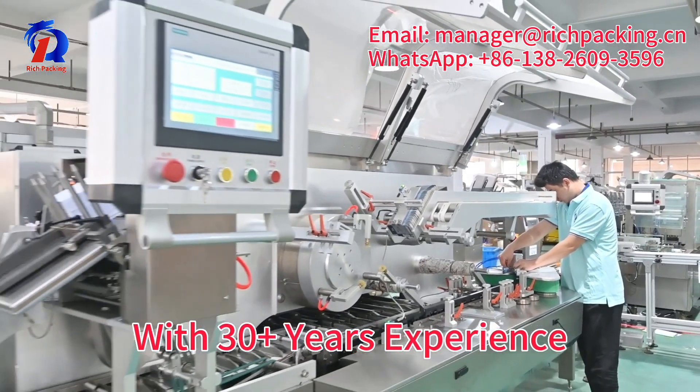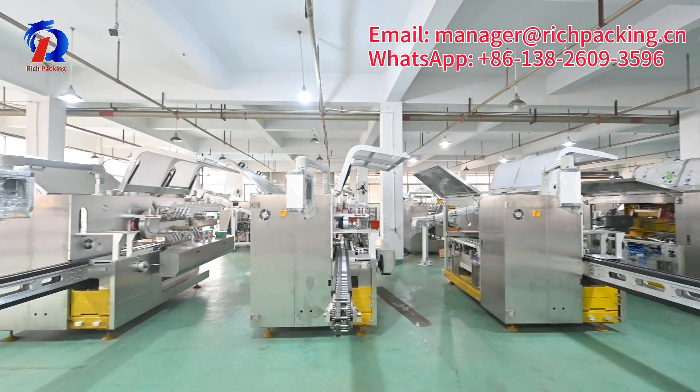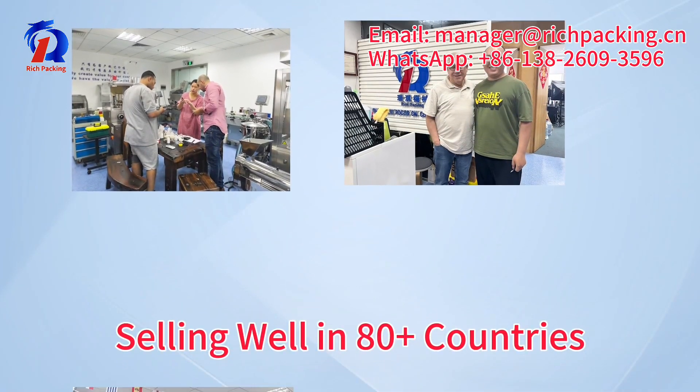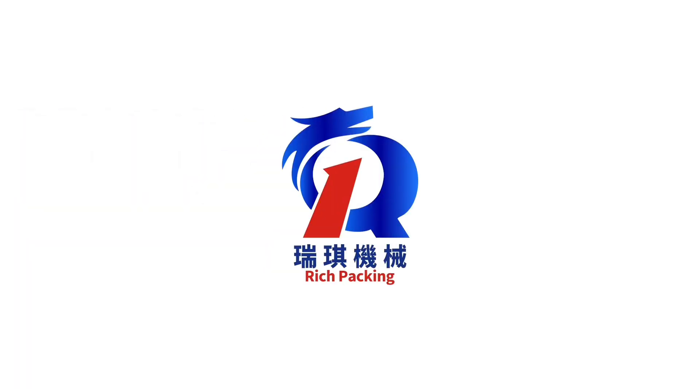With over 30 years experience and superior machine quality, our products are selling well in more than 80 countries. To purchase a cartoning machine, choose Rich Packing.